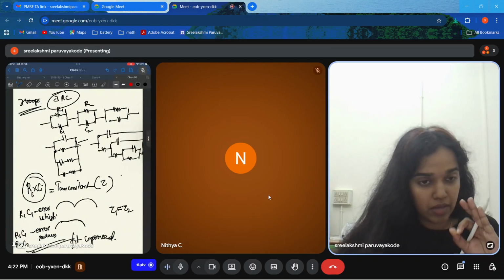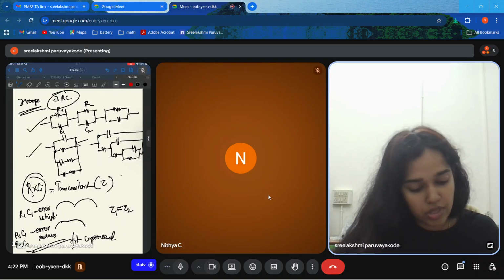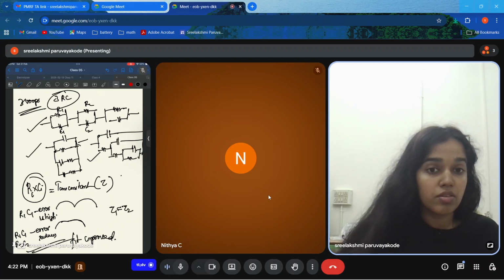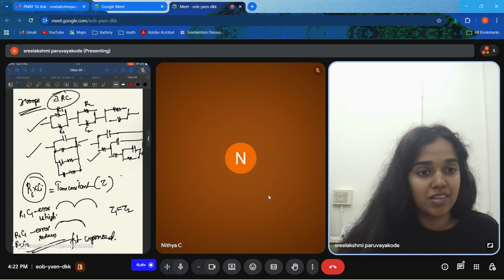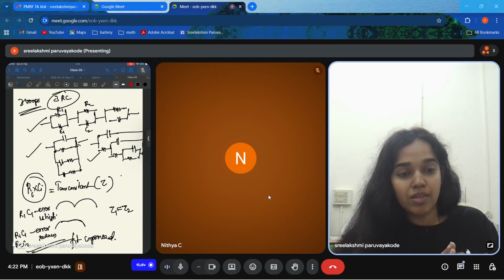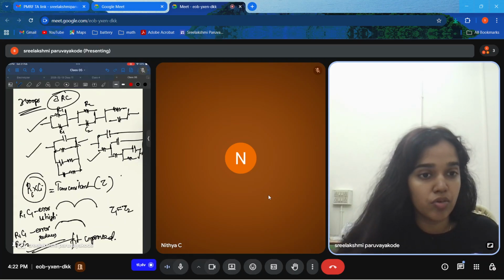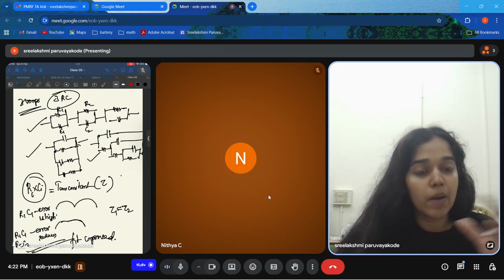Three RC loops means there are three loops, you need three RC. You can fit it using a Voigt circuit, a Maxwell circuit, or a ladder circuit. But shouldn't the circuit be unique? No. What did we mean there? We meant that the circuits can be used interchangeably. Interchangeably used means they are distinguishable in terms of the values of R and C used, but for the same system, your impedance can be fitted using any of those circuits.